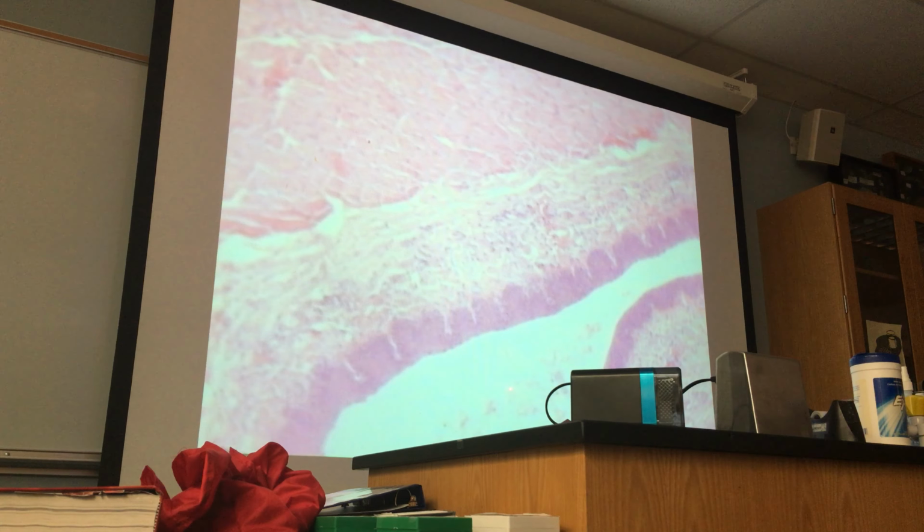And I might point with a pointer. Here we have a microscope with a pointer in the eyepiece lens, and that pointer can point to any structure, and I can ask you, identify as indicated. If I put it on this, then you can say mucosal epithelium of esophagus.